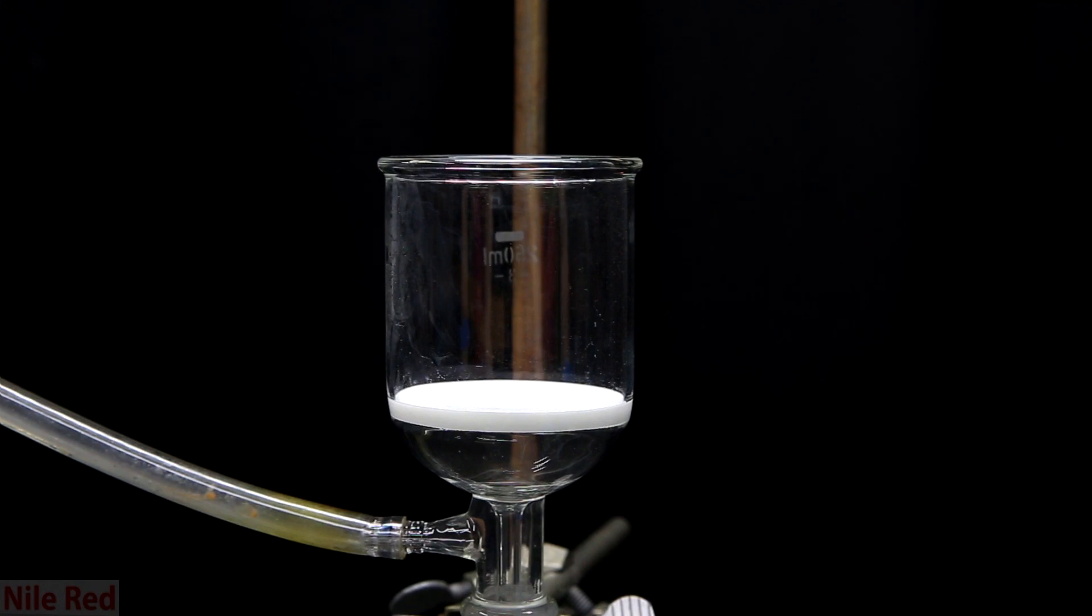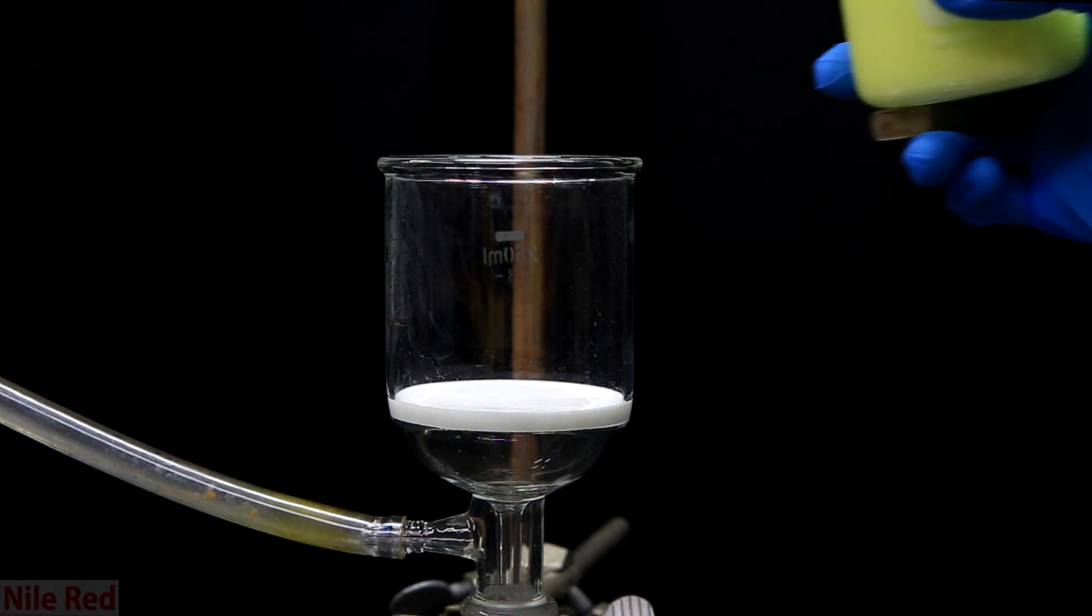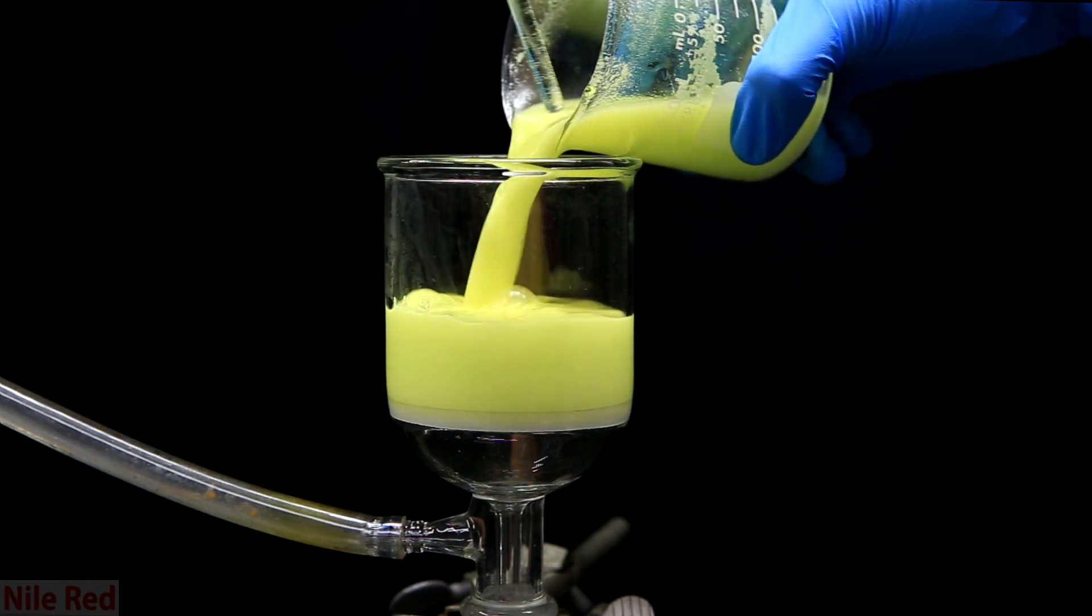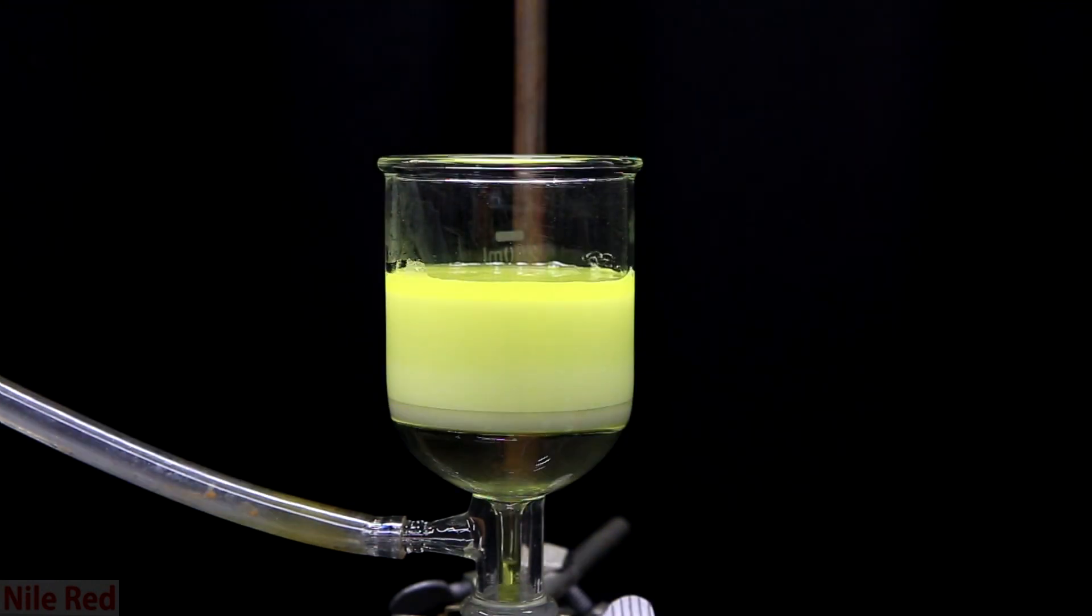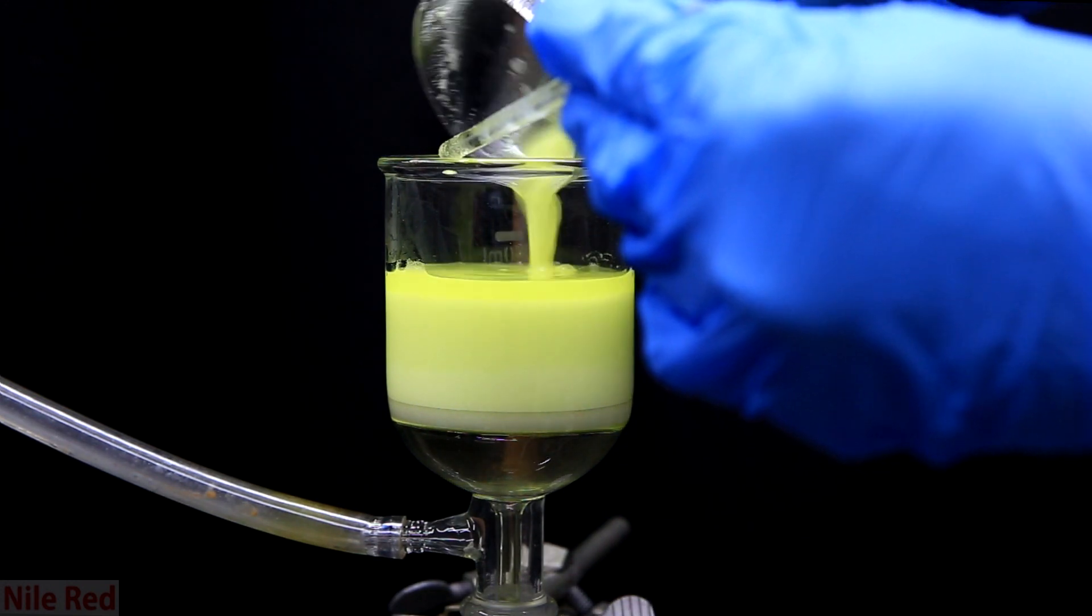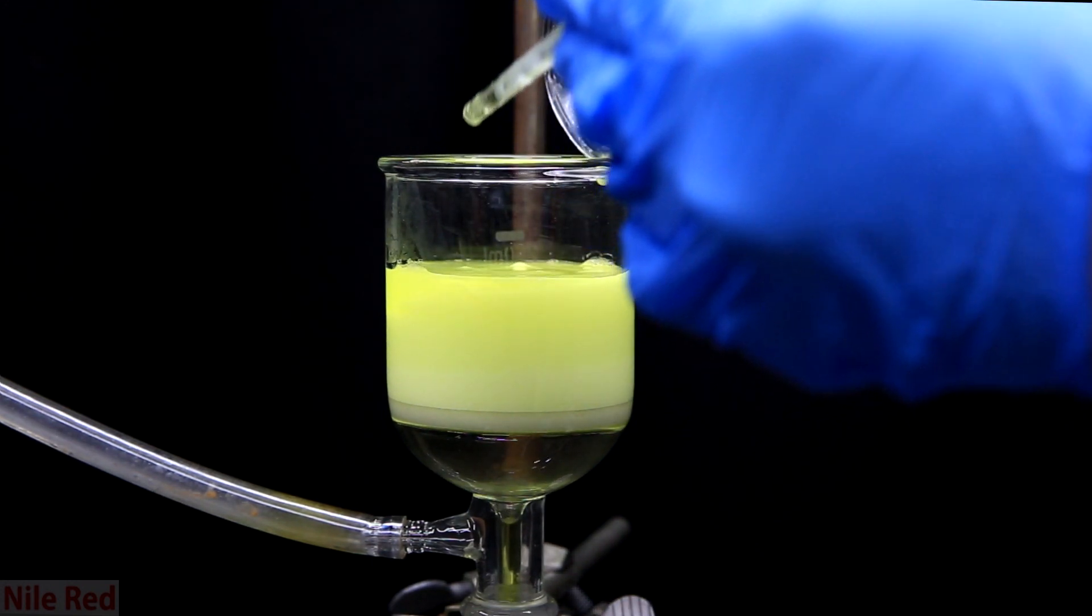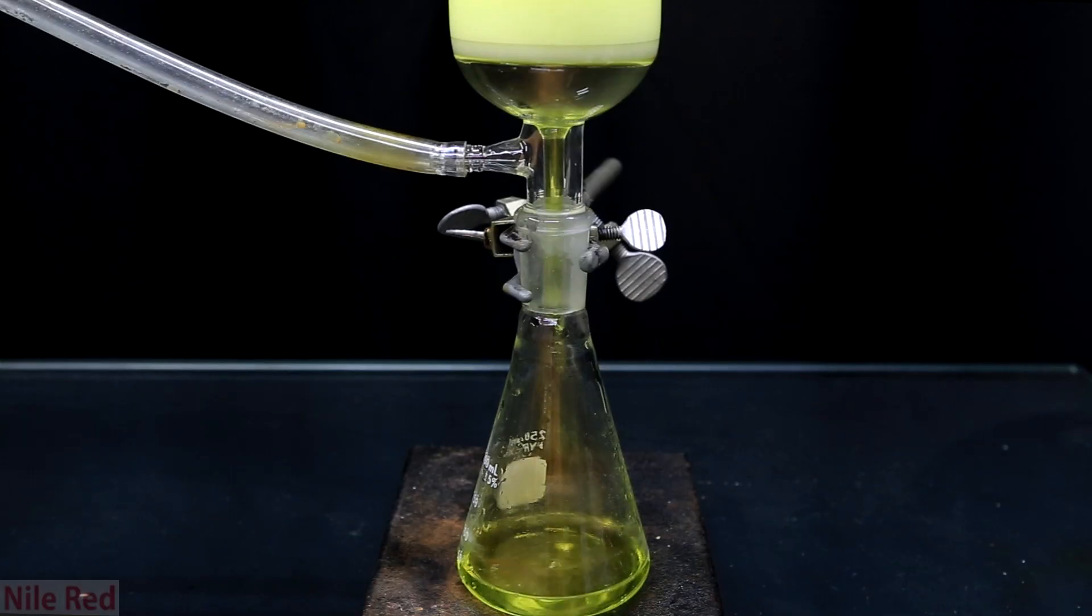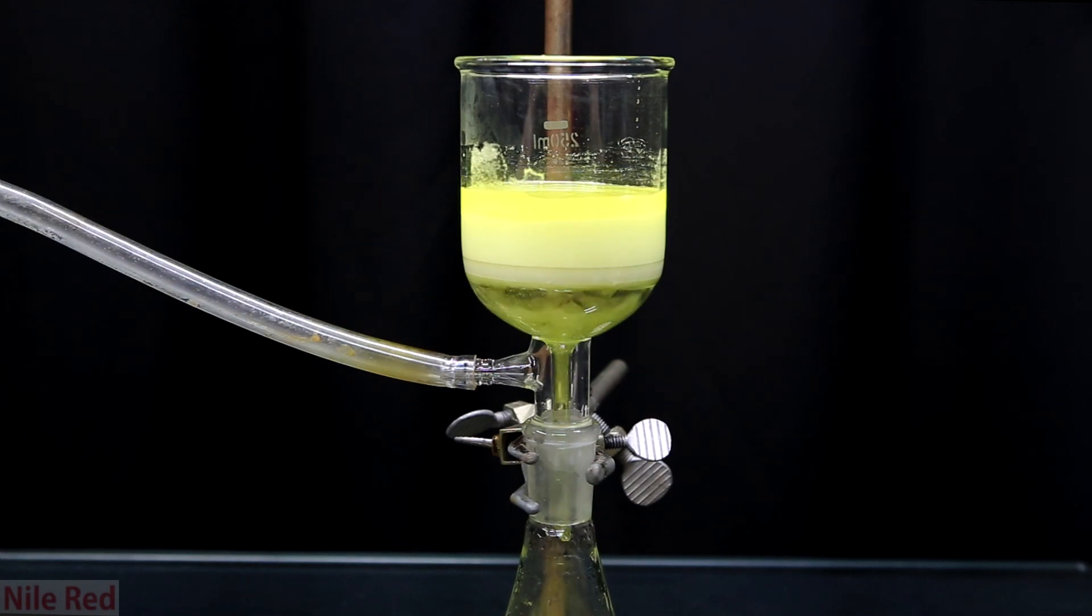This solid should consist mostly of 3-nitrophthalic acid so we filter it off. The mixture is stirred up and then it's poured into the filter. If you recall earlier, I said that we would be making both 4-nitrophthalic acid as well as 3-nitrophthalic acid. What's lucky for us though is that the 4-nitrophthalic acid is much more soluble in water and the 3-nitrophthalic acid is much less. So most of the solids should be our 3-nitrophthalic acid and most of the 4-nitrophthalic acid should be dissolved in the liquid.